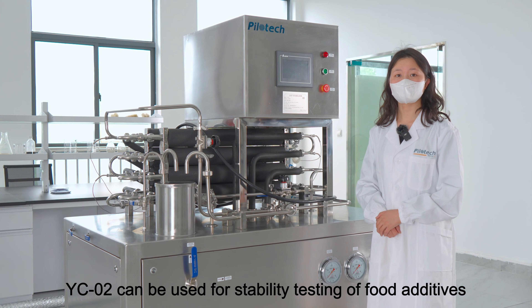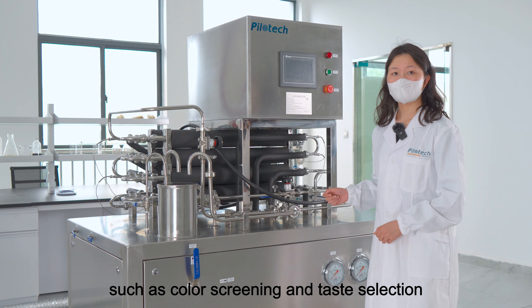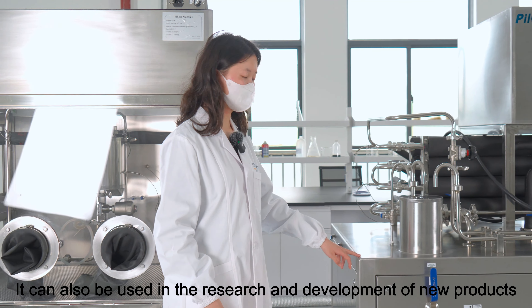The YC02 can be used for stability testing of food additives, such as color screening and taste selection. It can also be used in the research and development of new products.